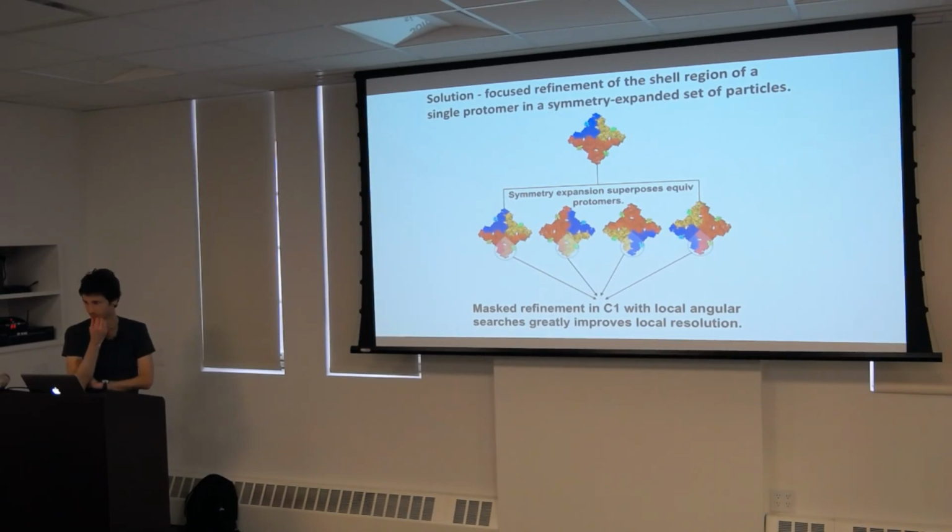But in those cases, you wouldn't necessarily rely on the Ramachandran plot that much. Oh no, when you're at 1 angstrom, you don't need the Ramachandran plot. It's when you have that information, you can use it as prior knowledge for other lower resolution situations. But yes, it should be the same from crystal structures as Cryo-EM, I would expect.